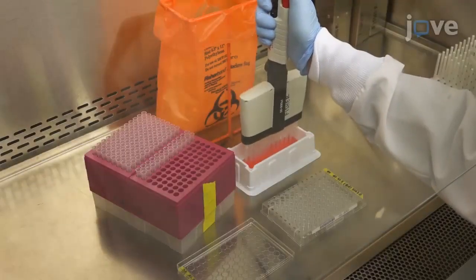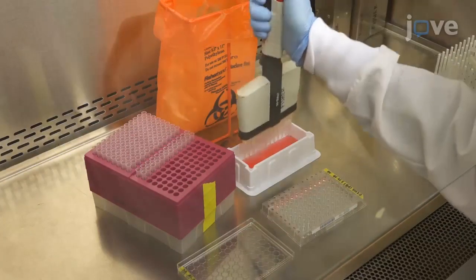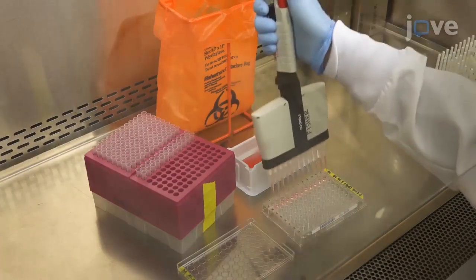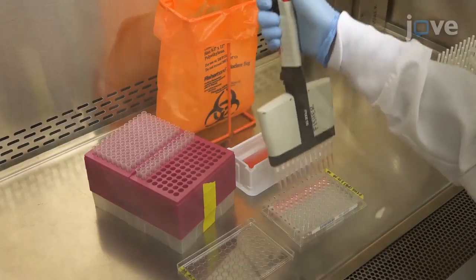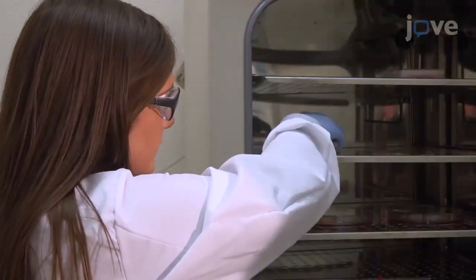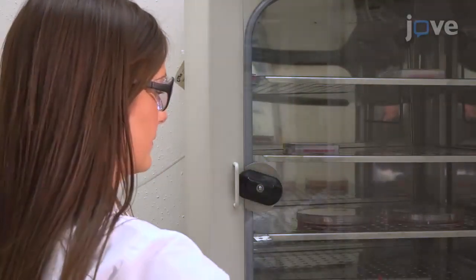To begin, seed C2C12 adherent cells at 2 × 10⁴ cells per square centimeter in rows A through F of a 96-well plate and cover the cells with growth media. Incubate the cells in a 37 degrees Celsius incubator with 5% carbon dioxide.